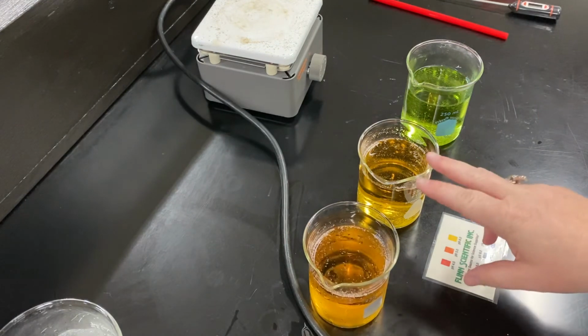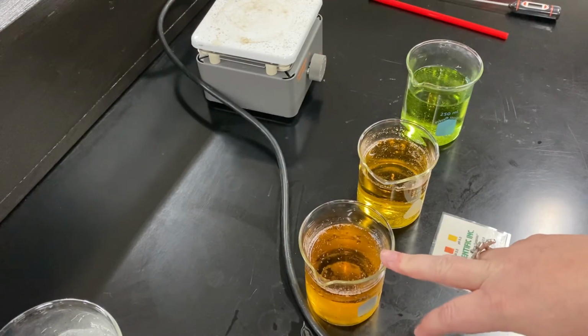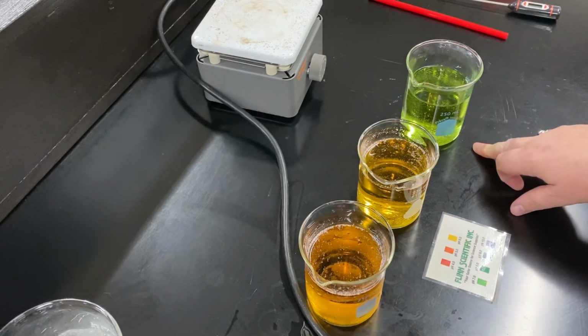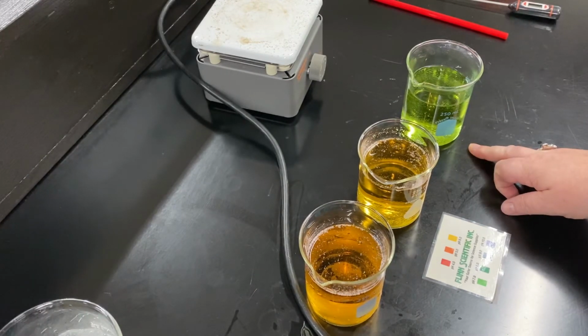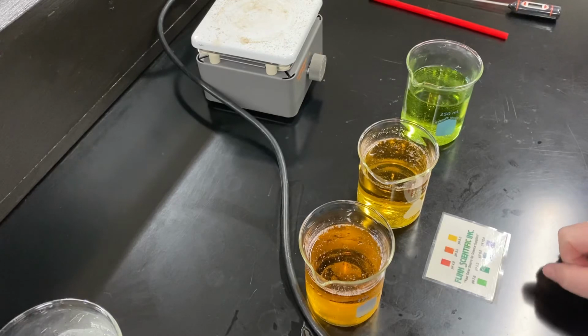So we've got a saturated solution for the room temperature, a saturated solution for the cold water. The hot water, we're assuming that this is an unsaturated solution. One, because it went so quickly, and two, because there is no solid floating at the top.